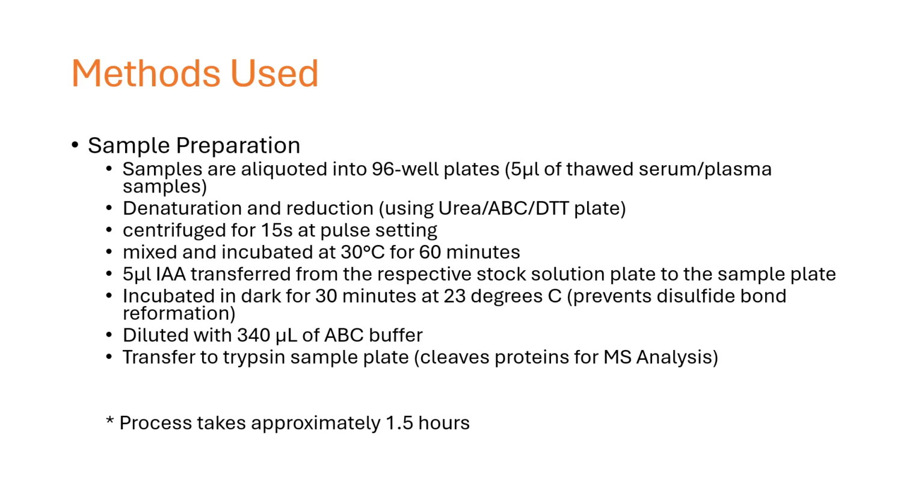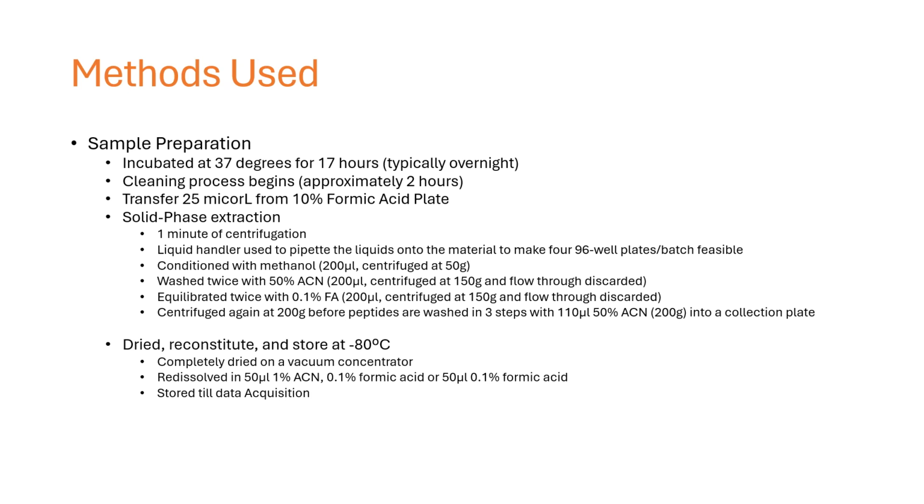They're then transferred to the trypsin plate, and that's what cleaves the proteins for mass spectrometry analysis. This whole process takes about an hour and a half, and it is done through robotics. All right, and then that sample plate is incubated at 37 degrees for 17 hours, typically overnight. After that, the cleaning process begins, and that takes approximately 2 hours.